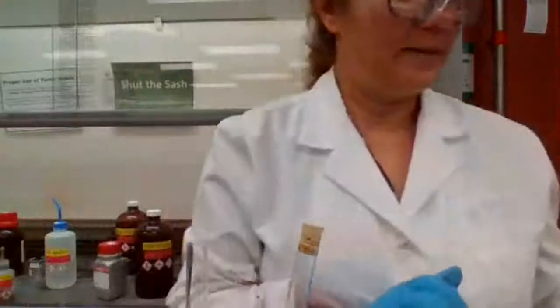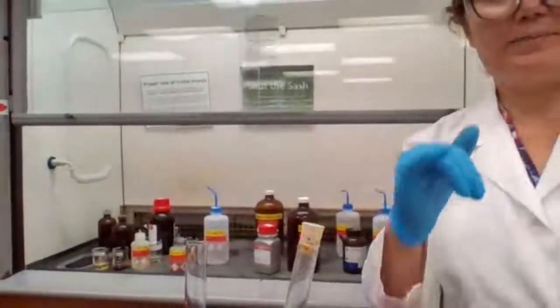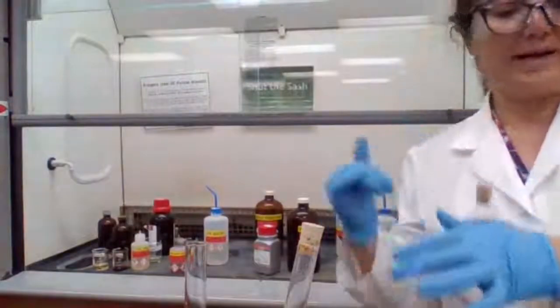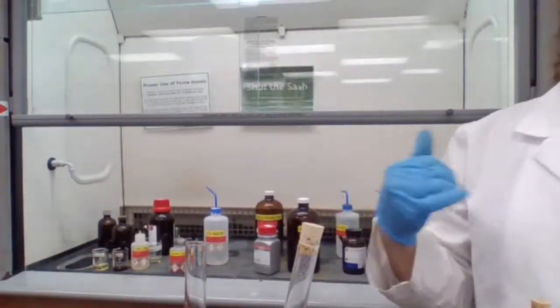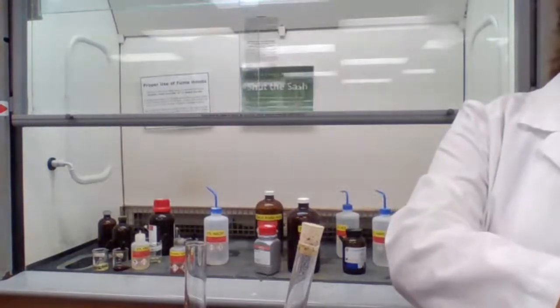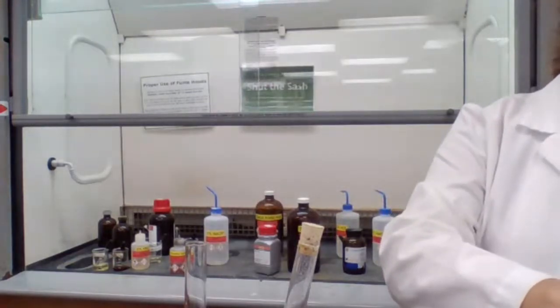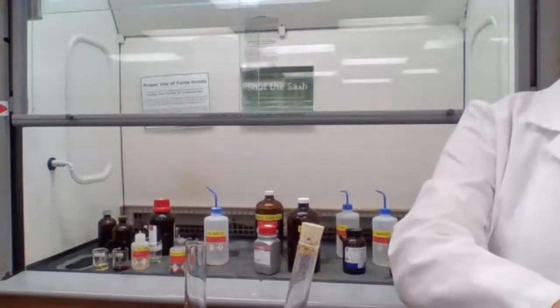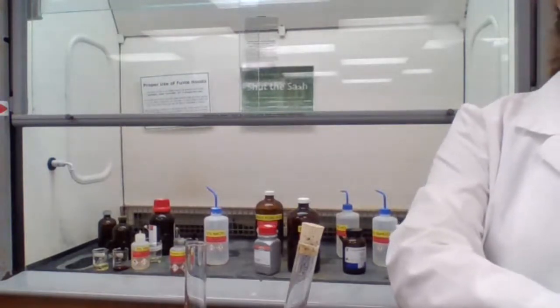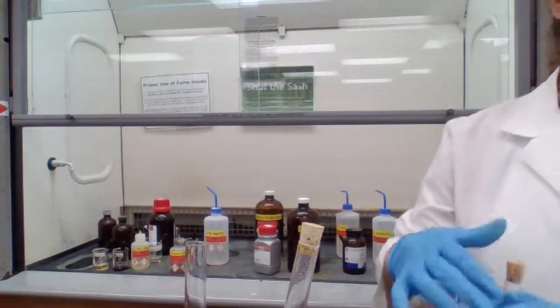So we found out about the primary. Now for secondary, I have to add the reagent, the benzene sulfonyl chloride.